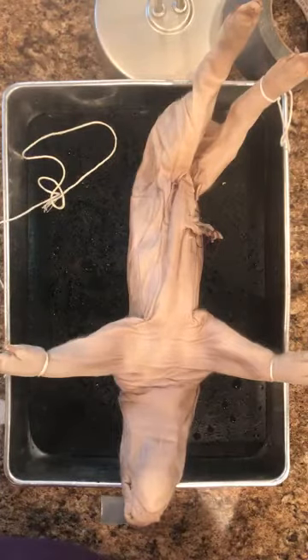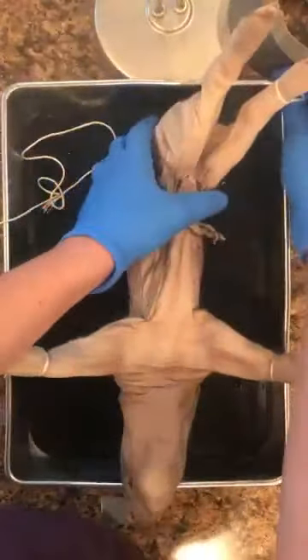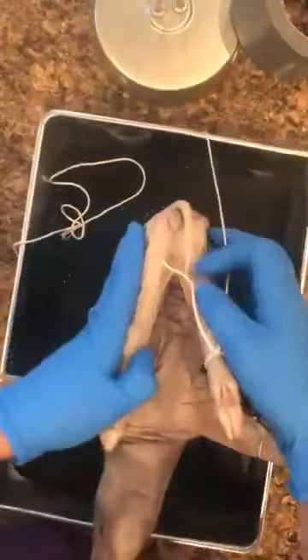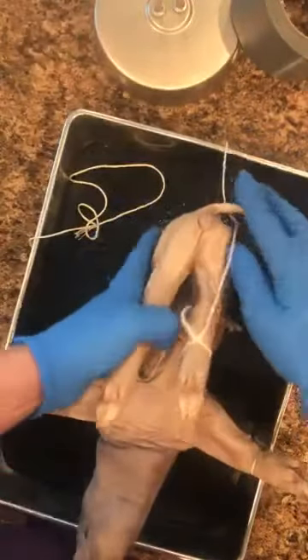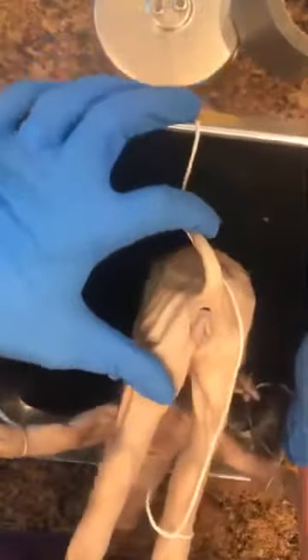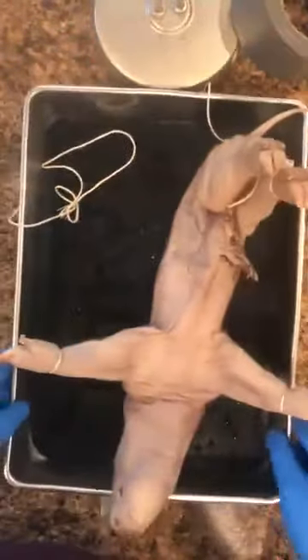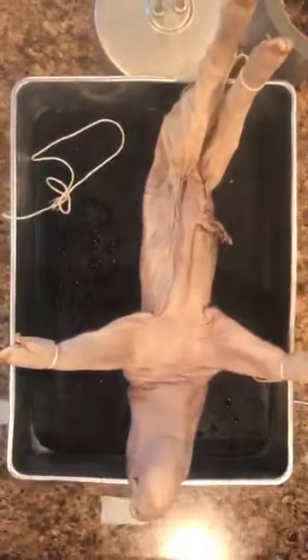We are going to spend time on the mouth and the digestive system. I have the pig kind of roped off here. That sounds terrible. But here is the female. You see this here: there is the anus, the urogenital opening, and then the genital papillae. I hope you can see all of this pretty clearly.